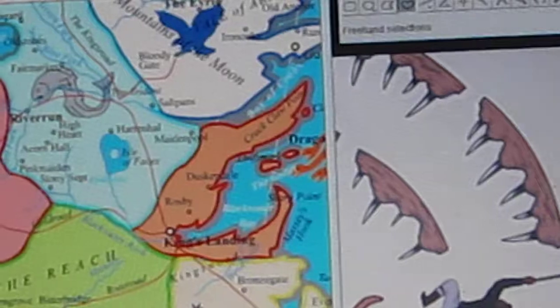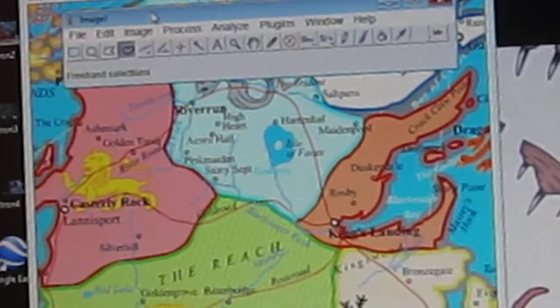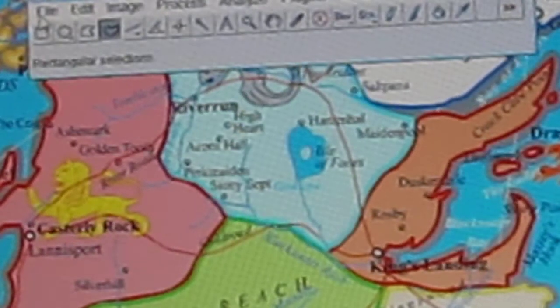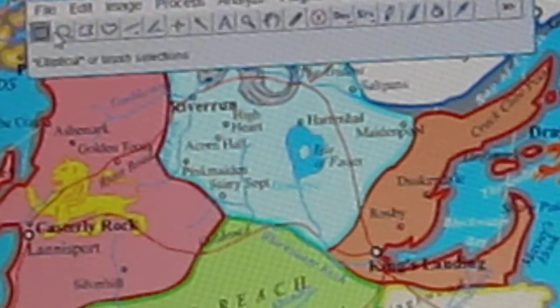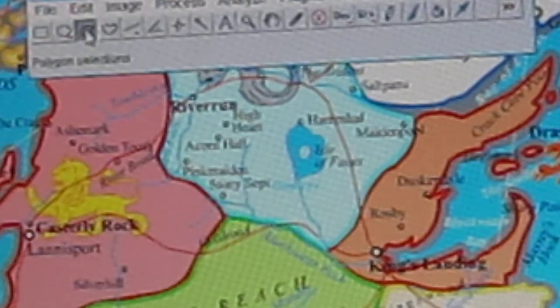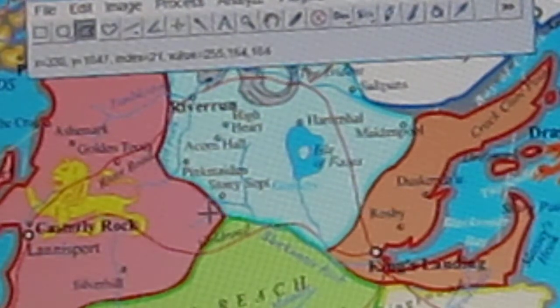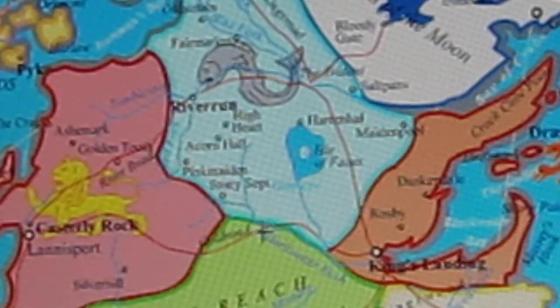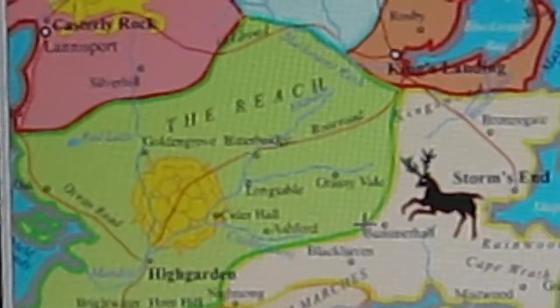So to do that, we can take our toolbar here. So underneath the file, we have various other boxes. So we can work out the polygon area with the third one along, this symbol here. So when we've got that selected, let's work out how much area these flower guys have got. So you put a click on there where you want to start, and then you can just about see maybe that I am drawing a polygon around the kingdom.